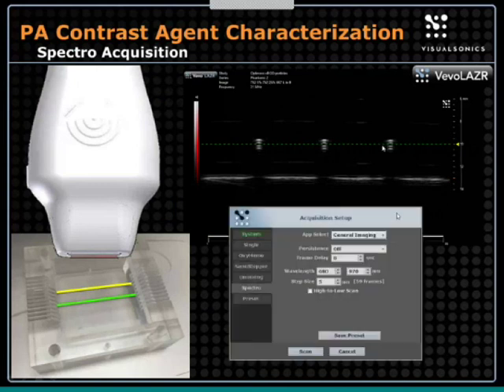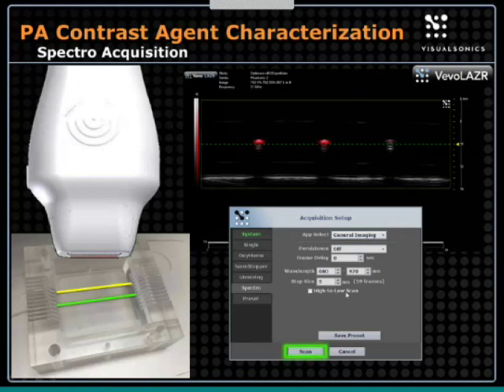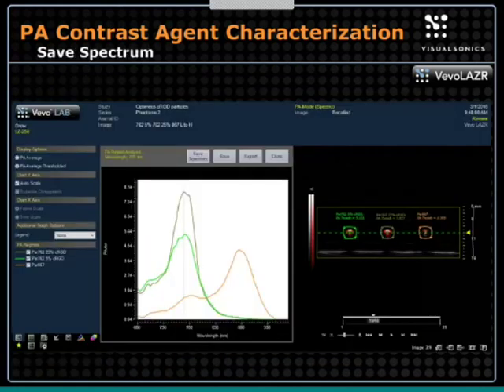And then we have this acquisition setup. So you select the Spectro Acquisition, and then you select the range. We want to scan the entire range at 5 nanometer step sizes, and then we hit scan. So it's just a single button for acquisition, one click. And then you'll see the changing signals here, and those changes represent the change of signal intensity with the change in wavelength.